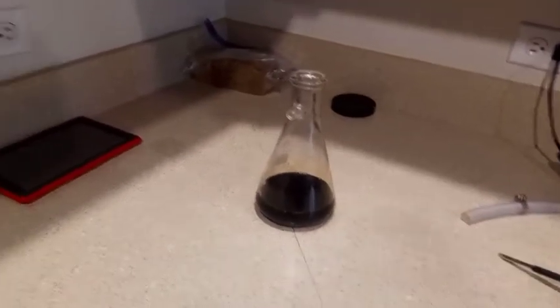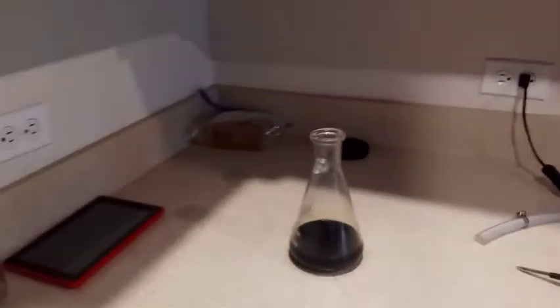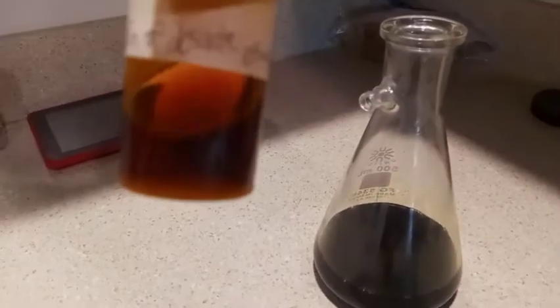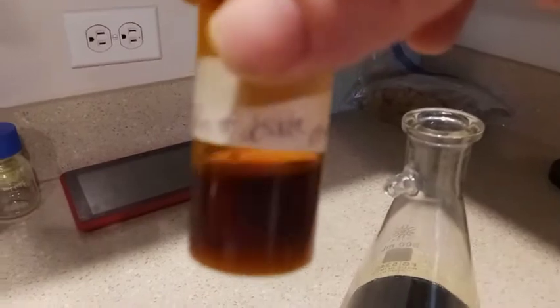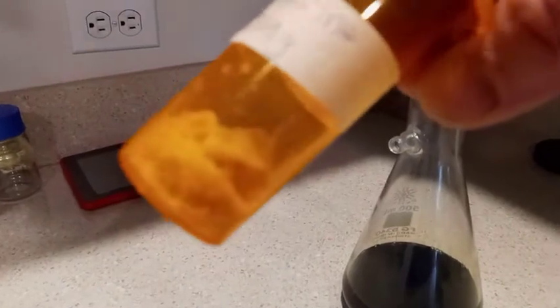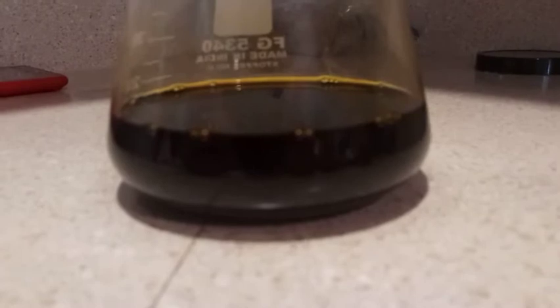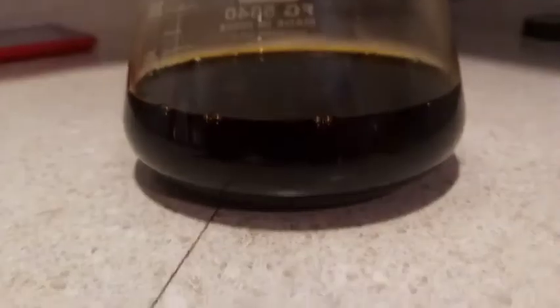A lot more fats are going to get left behind, which is okay. Just for comparison, this is my piperine solution post crashing-out and recrystallization — this is the final product, piperine: 5.9 grams. This is the stage where we're going to add water to crash everything out of solution. This is definitely my least favorite part — the particles get so small they clog the filter and it's difficult. It takes a couple of hours, so we'll get that going now.